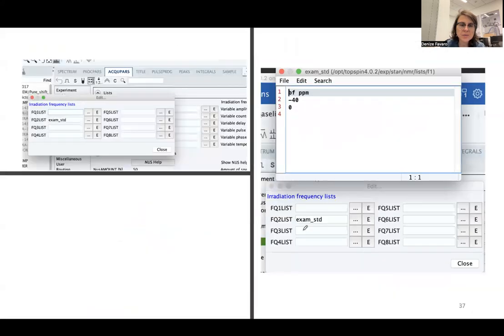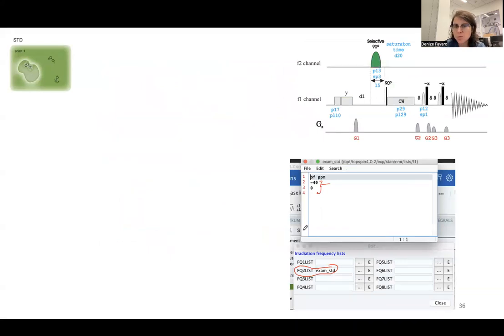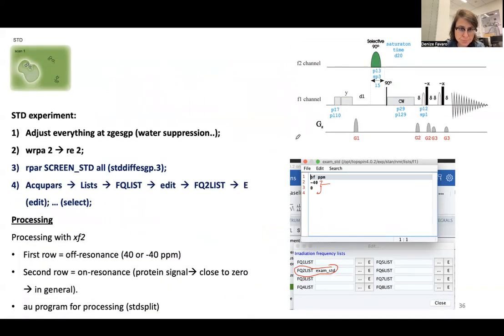So how do I set this experiment? There are a lot of pulse sequences, but I especially like this one, it's called STD, as STD diff ES for excitation sculpt GP dot three. This is one of the pulse sequences I like. What are the parameters that I have to set for my experiment? I have to have this FQ2LIST.